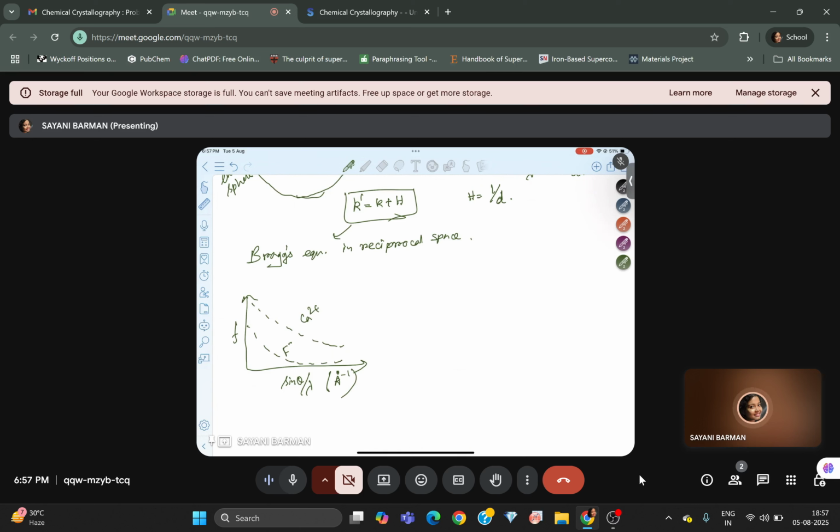Now you all know the electronic configurations of these two atoms, and you can understand how many electrons there are for each atom. Now, for a given angle 2 theta, the net intensity decreases with decreasing lambda because the phase difference gives a greater degree of cancellation for smaller lambda. Now, XRD patterns at higher angles are usually weak.